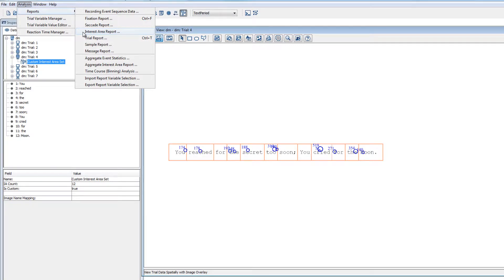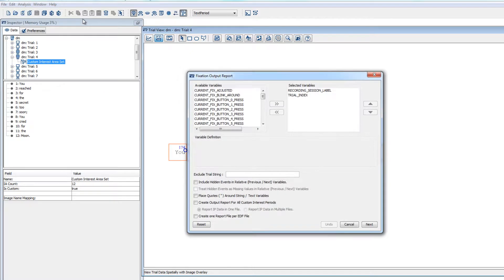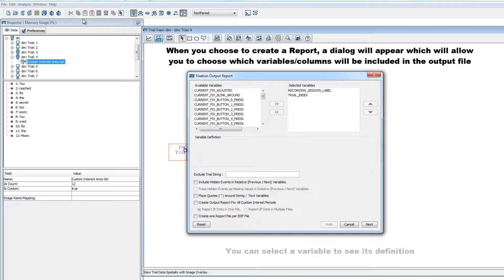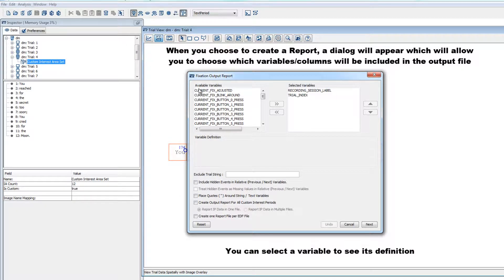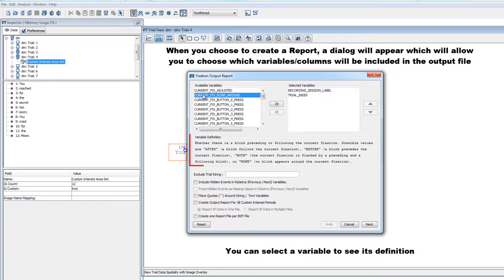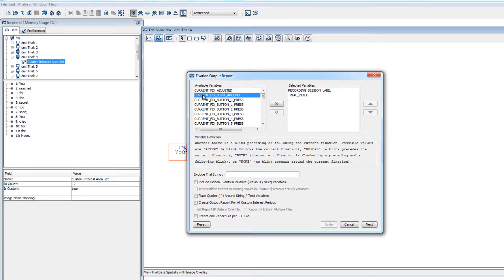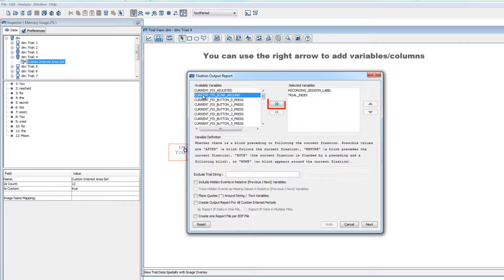When you choose to create a report, a dialog will appear that will allow you to choose which variables will go into the report. These variables will become columns in the output file, and you can click on each variable to see its definition below. To add a variable so that it becomes a column in the output file, simply select it and use the arrow button to move it over to the Selected Variables section.